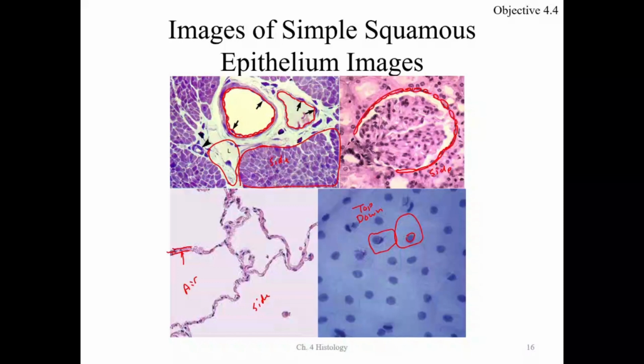Now, it will take you a while looking at it before you can start to see what I'm sketching, and then you'll start to see it. One of the things I do with my tissue is I do expect my students to be able to look at pictures that aren't in the notes on the test. So the test will have different pictures. I want you to learn characteristics and be able to identify them based on characteristics, not just memorize one picture.